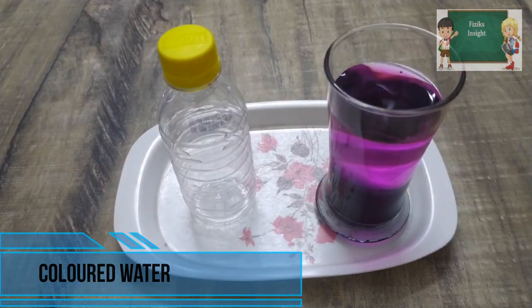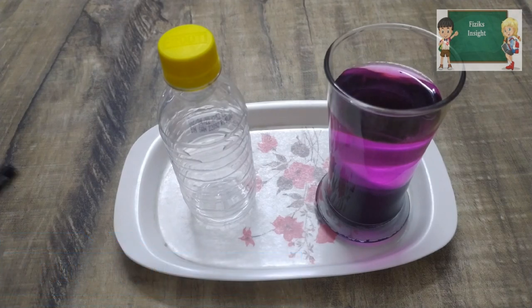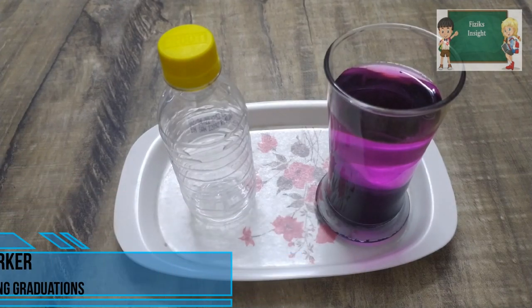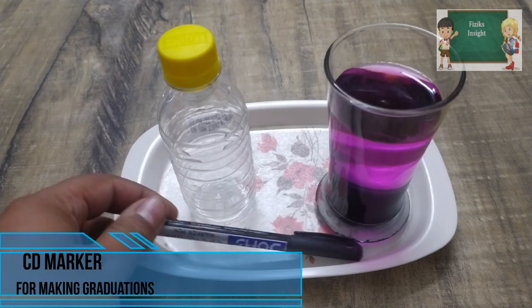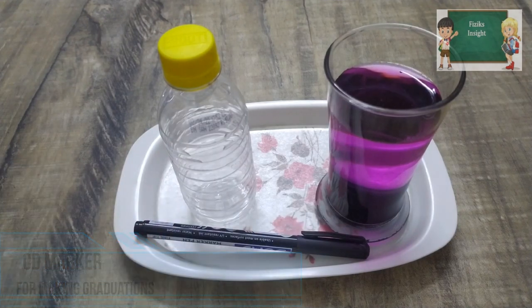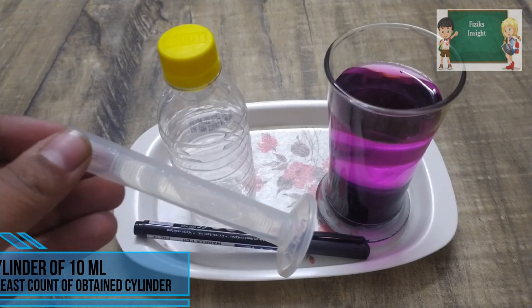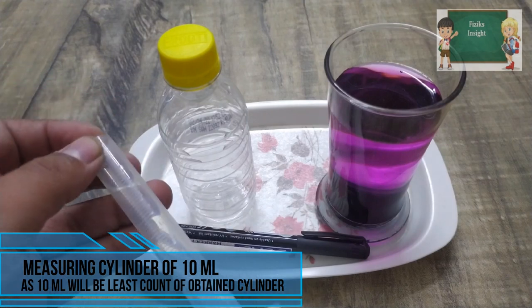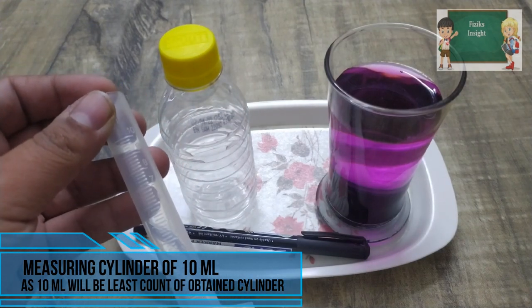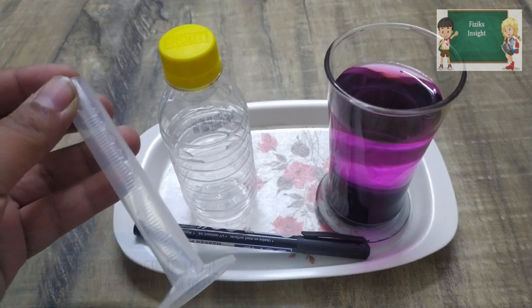some colored water, a CD marker for marking graduations, and a measuring cylinder of 10 ml. The least count for the cylinder obtained is going to be 10 ml.